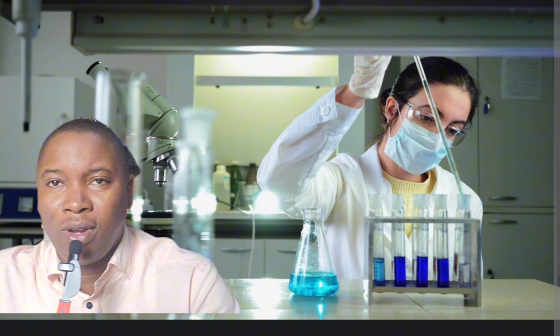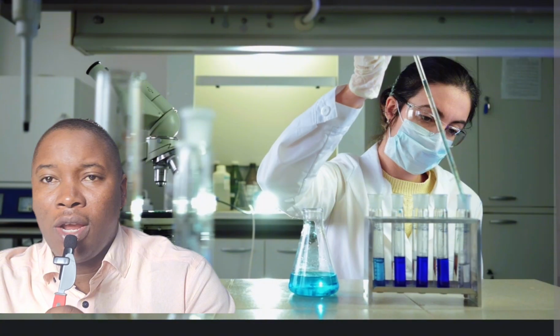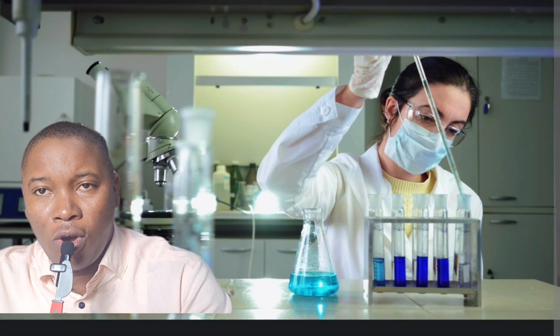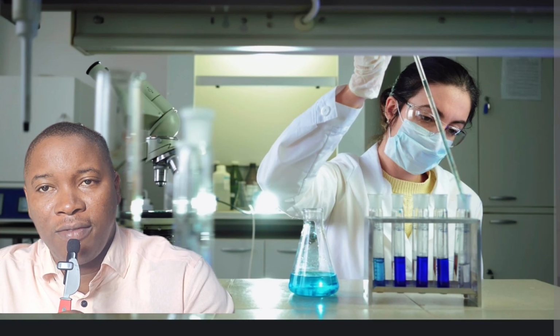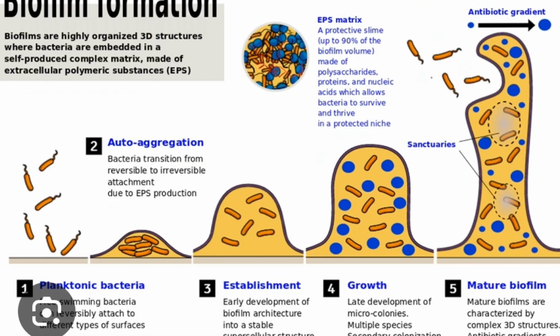It's important in microbiology because it helps us with diagnosis. Also, indole is an important compound for what we call quorum sensing, which we've discussed in some earlier videos. Bacteria have the ability to speak to one another, to call to one another, to rally each other together to form a community, to form what we call a biofilm.